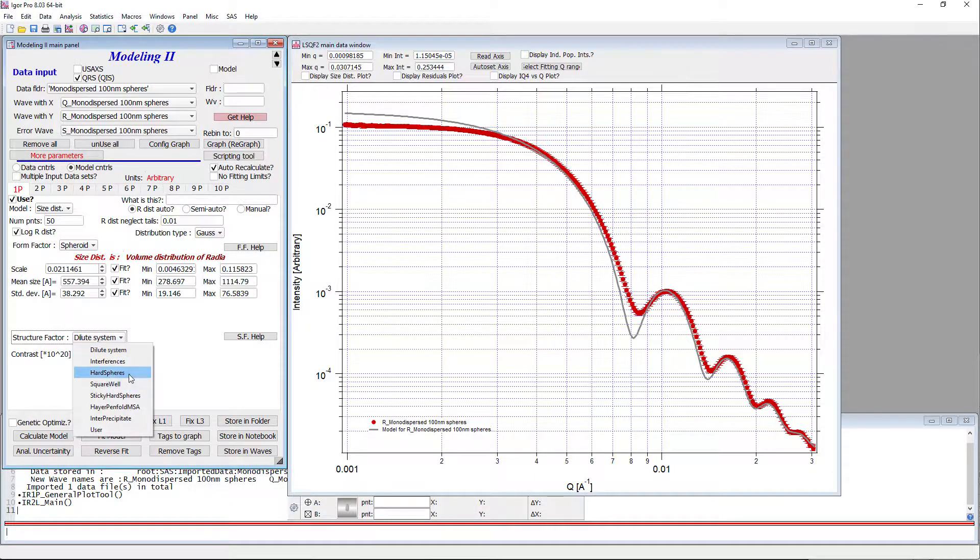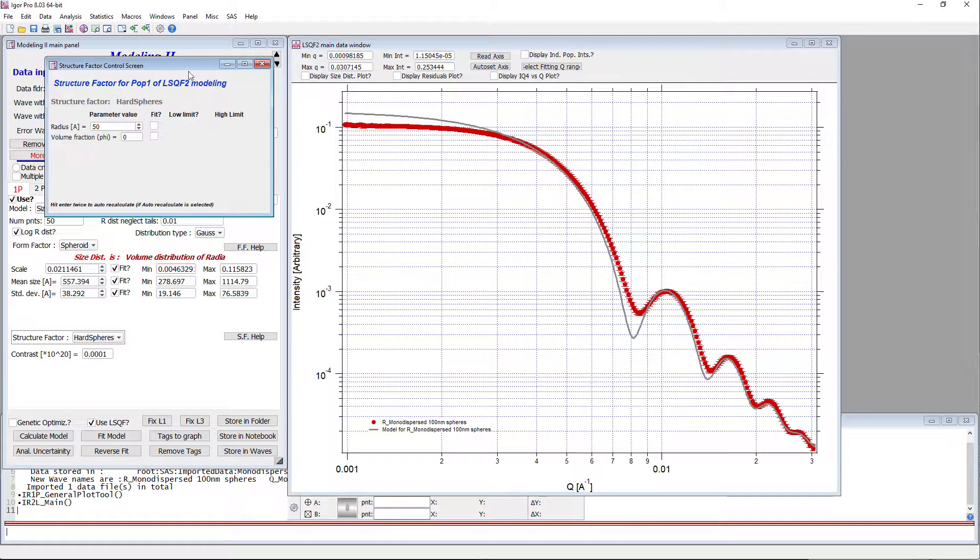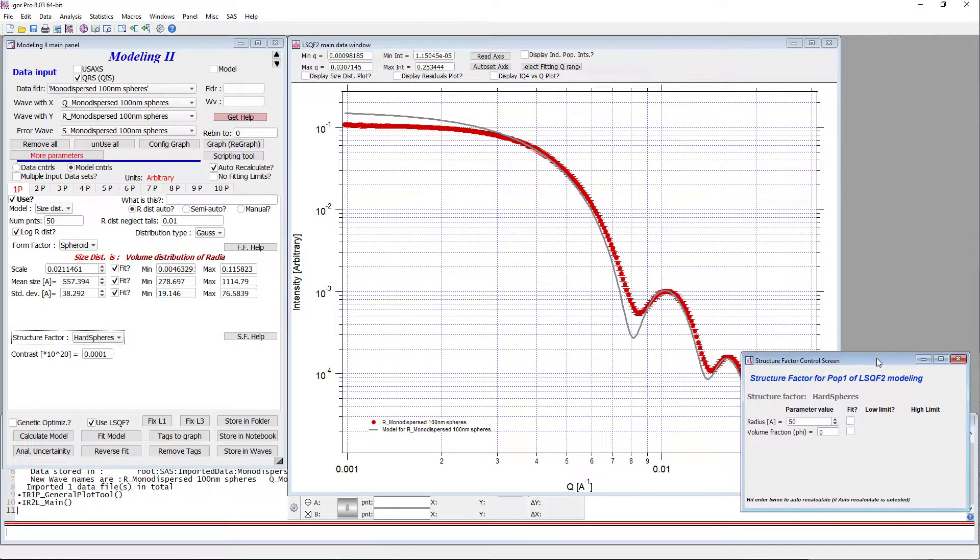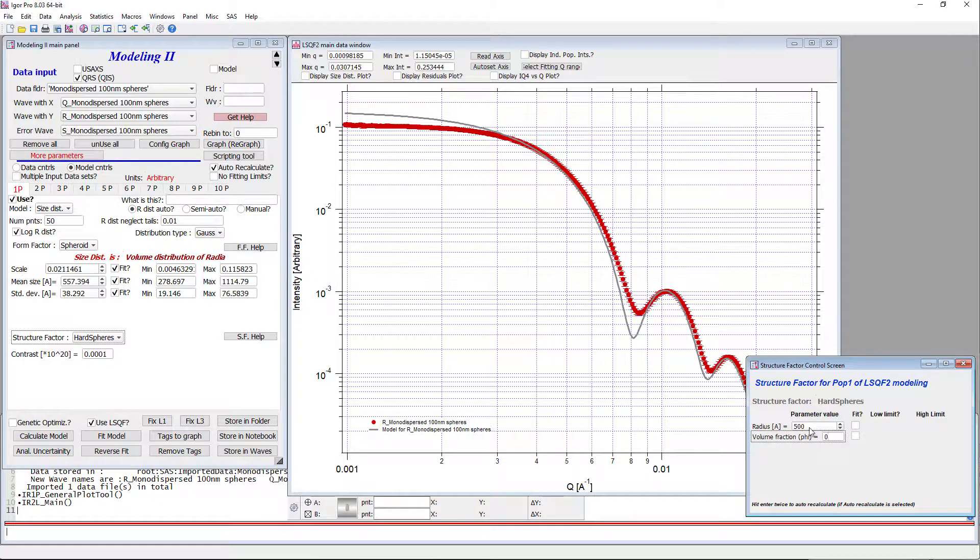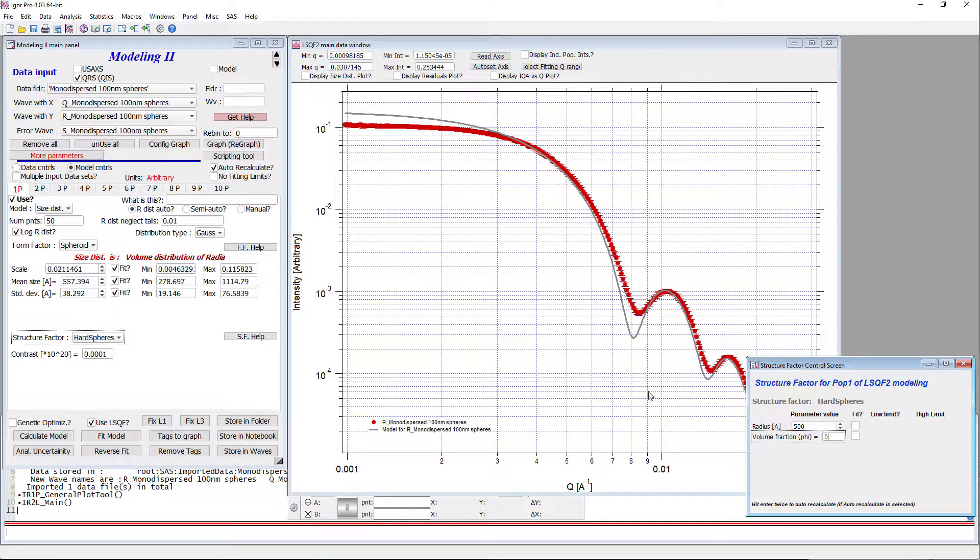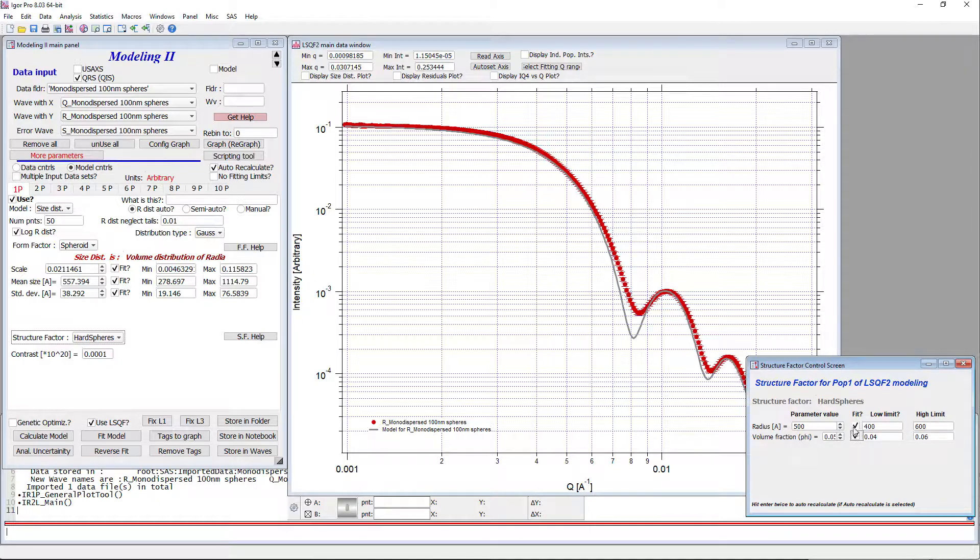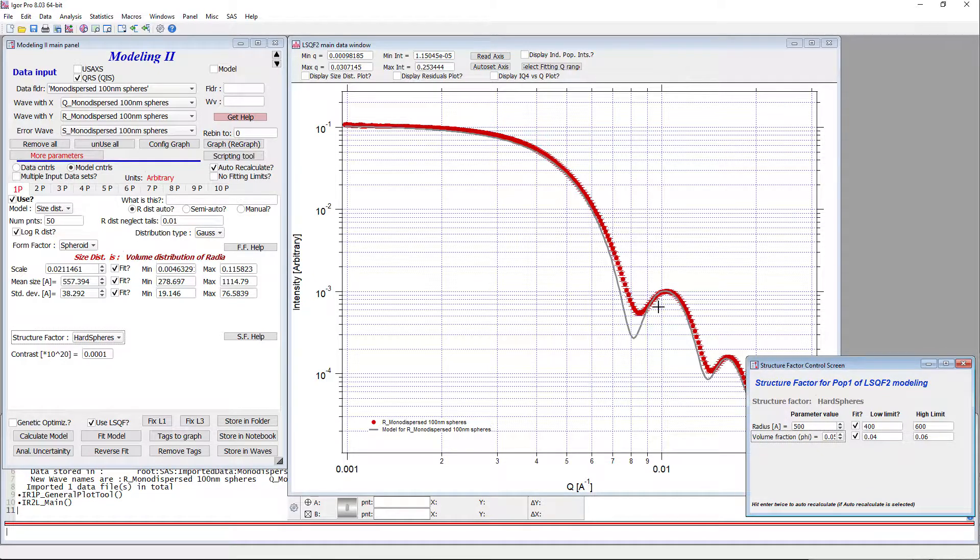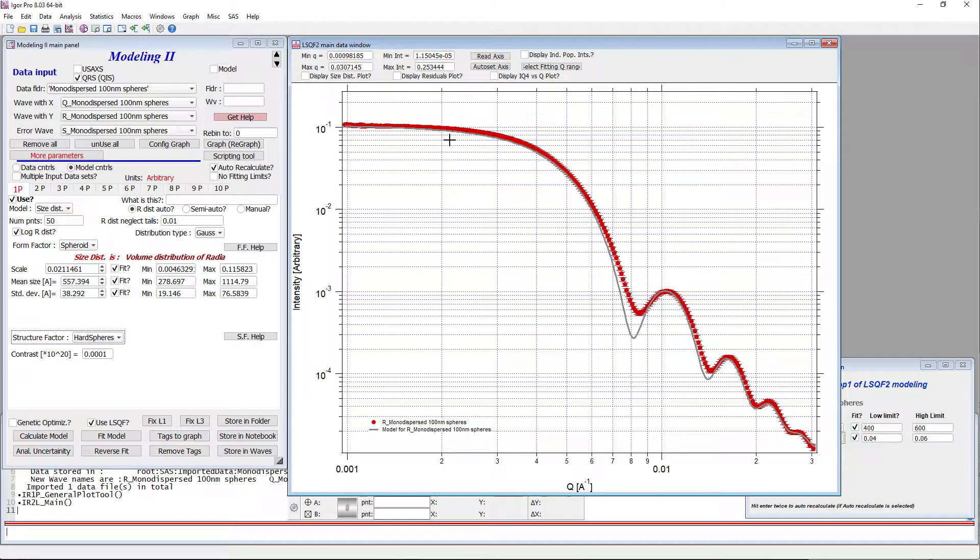There are lots of structure factors available and it's not necessarily clear which one's going to be the right one. I have found out that hard spheres kind of work, so I'm going to use hard spheres even though I'm not necessarily sure that it's the correct structure factor. So I have put in here 500 because it's the radius of the sphere and it's about 557 here, so at least 500 here. And I'll just throw in some volume fraction like 0.05 or something. We can fit them. If you make changes in this control screen, you can try hitting twice and it should recalculate. And as you can see, it recalculated.